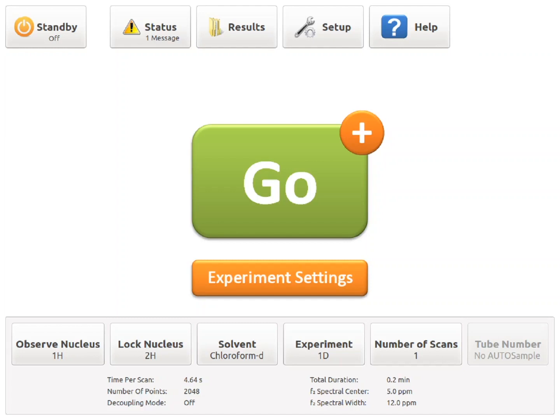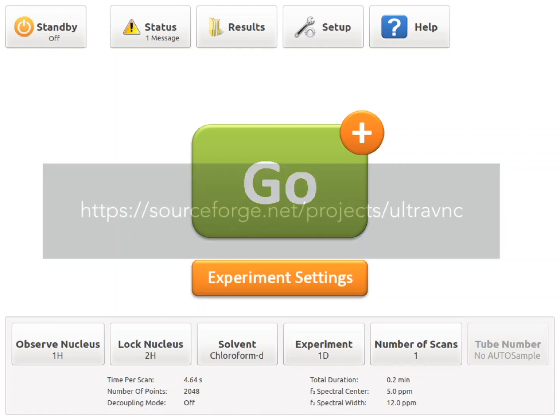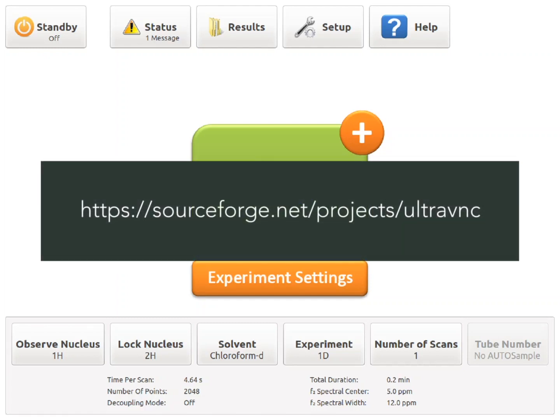For this, we will be using the VNC protocol, and this tutorial will require the use of the UltraVNC software, available from the following website. Please feel free to pause the video while you download and install the software. Note that a screen resolution of at least 1024x768 and Windows 8 at a minimum is required to properly connect to the spectrometer.